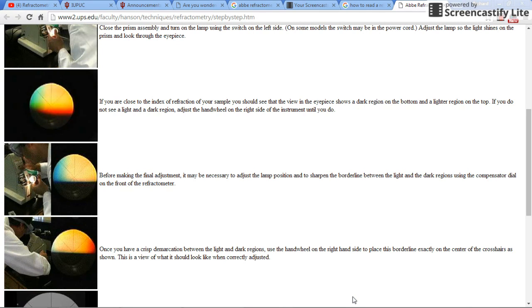You will have one of those compounds from page 96, because that's where I chose the unknowns from. And then you can refer back to page 94 to check the claim that it has an octane rating high enough to use.